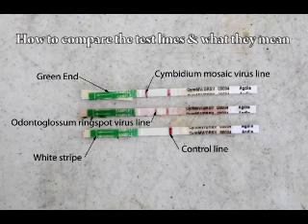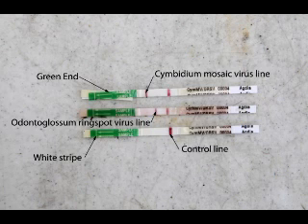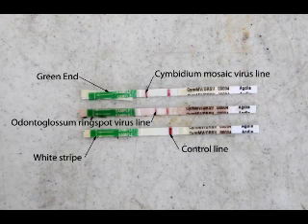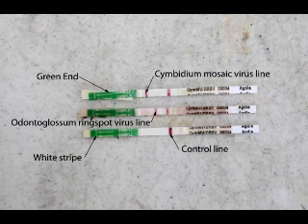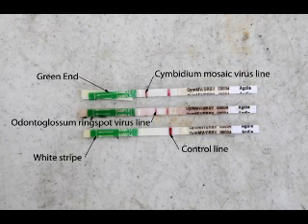As we wrap up this video, let's review how to use the test strips and what information they provide. First, note the green end — that is the end immersed into the solution being tested. Also notice the white stripe on that green bar; that is the point at which you do not immerse past. As the fluid works its way up the strip, the first bar that would appear would be the cymbidium mosaic virus line. The second bar that could appear would be the odontoglossum ring spot virus line. The third is the control line, which is very important — if you do not have a control line appear, you do not have a valid test and you'll have to retest.